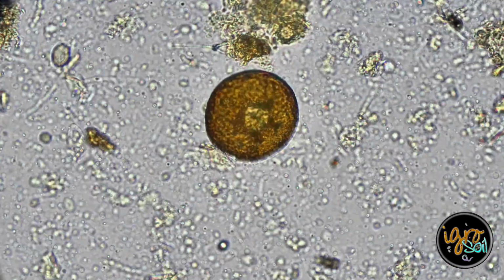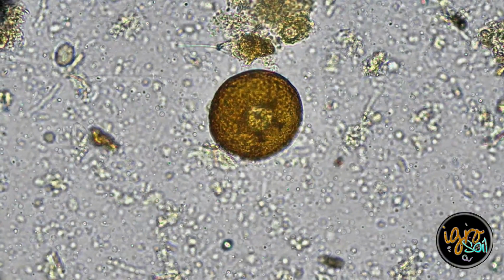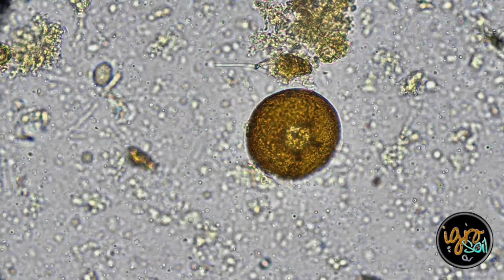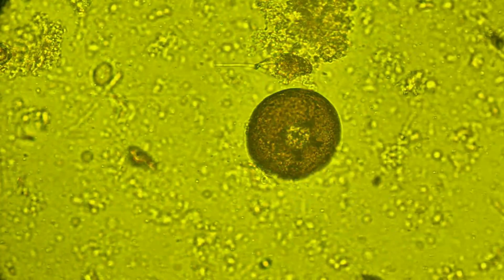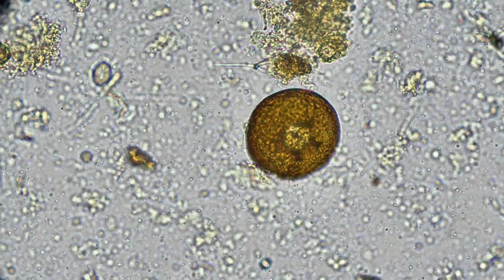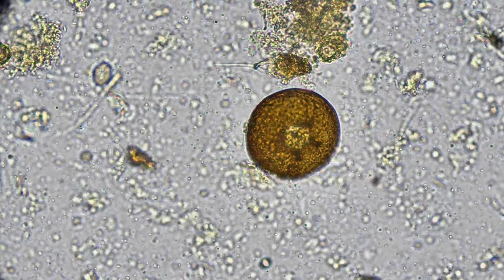Oh, look at this Arcella. Wow, that is big. This is an amoeba. That is a beautiful amoeba. Let's see if he lights up. Nope. That is an amazing looking amoeba. Big. I'm at 400.